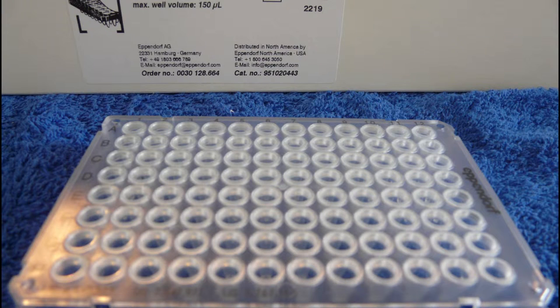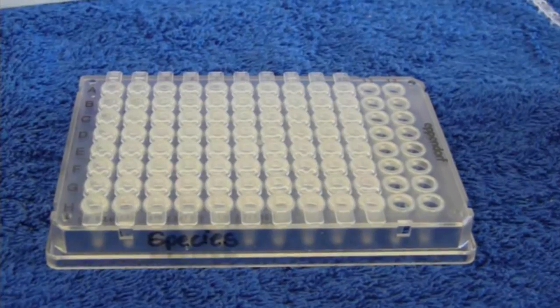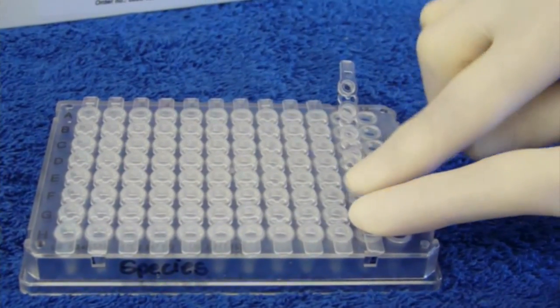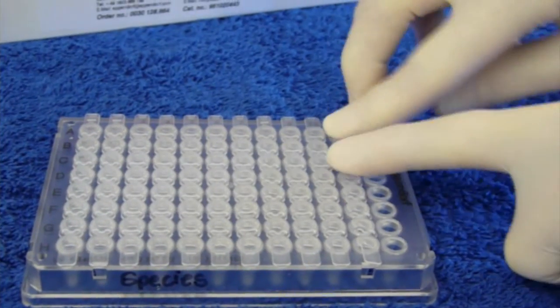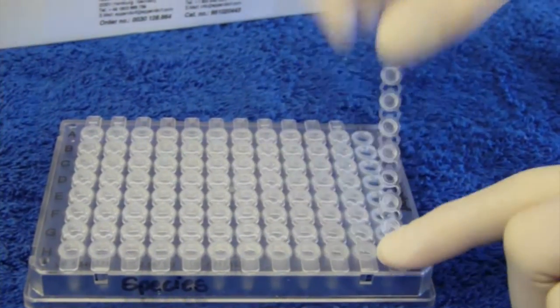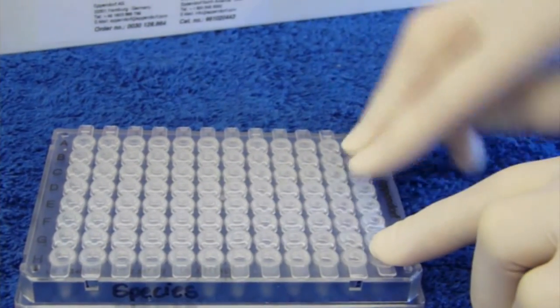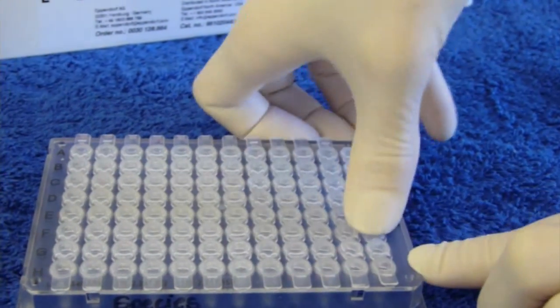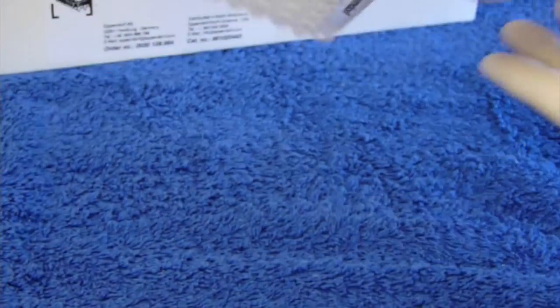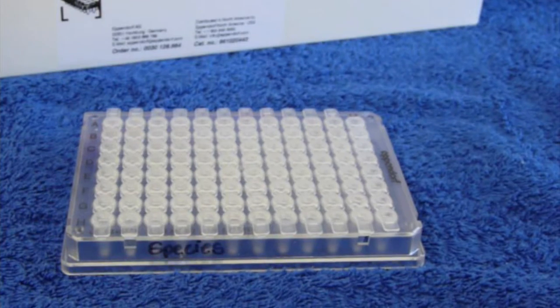We recommend using Eppendorf 96-well Twintech Fully Skirted Plates and strips of Starred Set 8 clear flat caps made in the USA. You can use up to 94 samples per 96-well plate. The DNA is to be suitable for restriction enzyme digestion and ligation. Each sample is to be 20 microlitres of DNA in TE or other aqueous buffer at about 50 to 100 nanograms per microlitre.